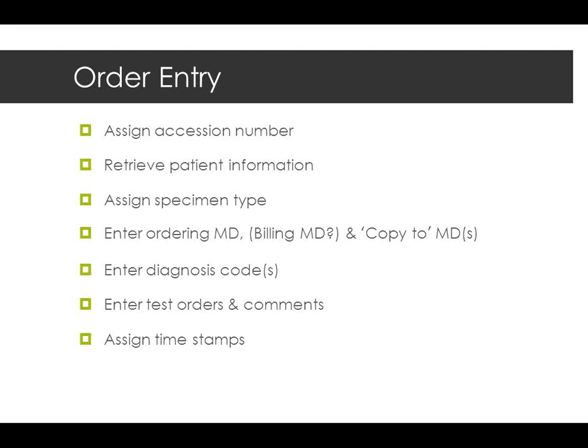Most of this eventually will be handled by Apex, and we won't have to deal with a lot of it, but currently we still do. I need to enter those diagnosis codes that I'm getting for my medical necessity checking. We'll talk a little bit more about that. I need to enter any test orders and comments. So things like, I want you to fax this to this number, I want you to call it to this number, those kind of requests that come in with the orders, or comments. Things like, this is a pre-dialysis sample, this is a post-dialysis sample. You don't want to mix those two up, and you want to make sure that the clinician knows which one is which when you report it.